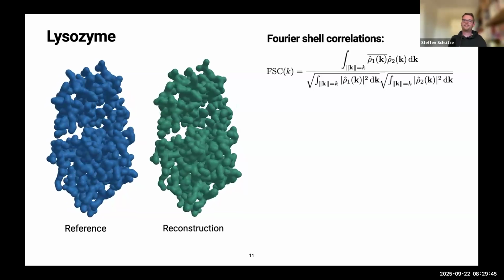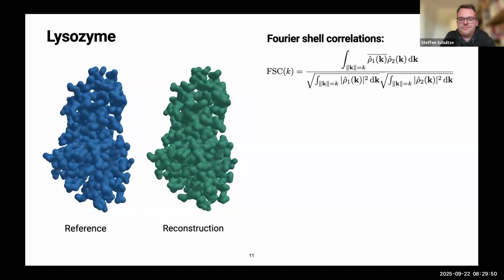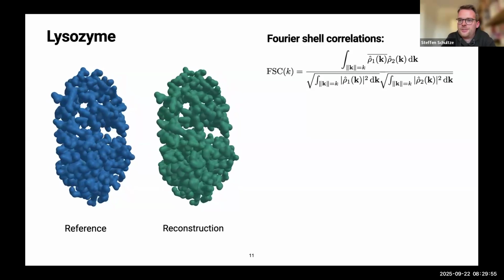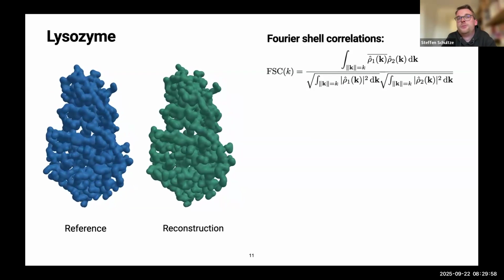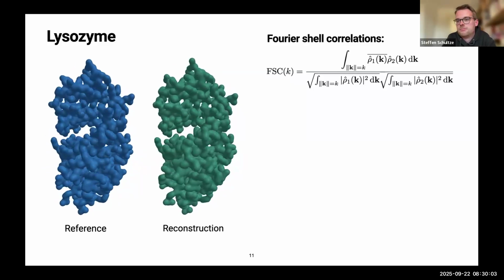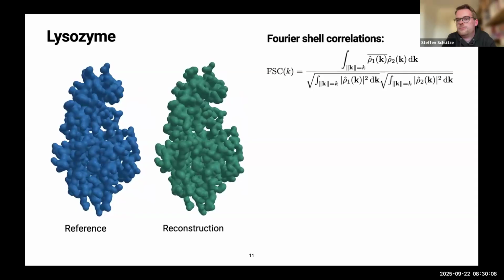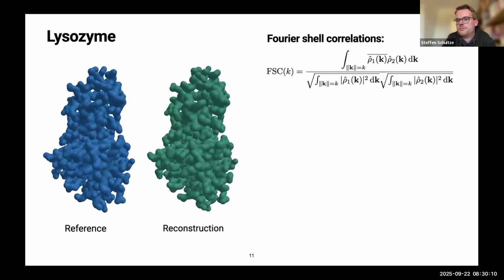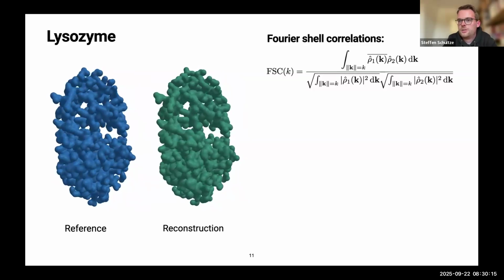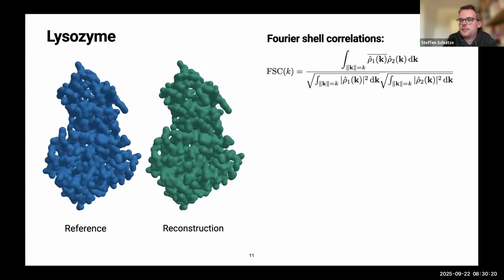Because it's just a big laser already. An X-ray free electron laser is already 3 kilometers large as far as I know. Building a bigger one is not so easy. The alternative would be to increase the focus, but with X-ray optics, even that is tricky. You would also always sacrifice hit rate there. It's just that a single molecule has such a low cross section compared to a nanocrystal, so that you don't get many photons there. That makes sense. Thank you.